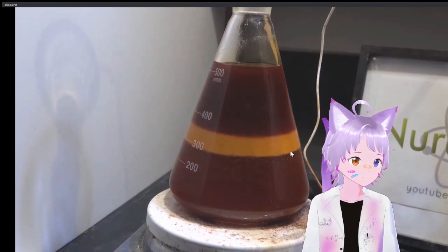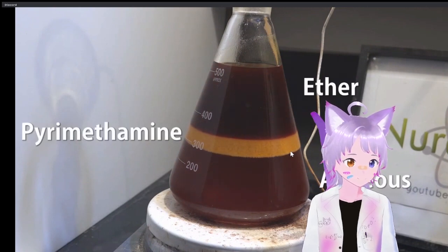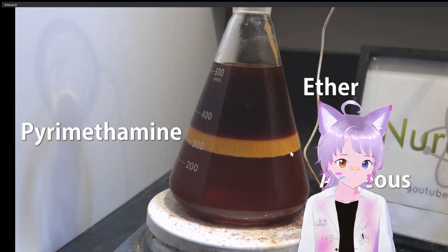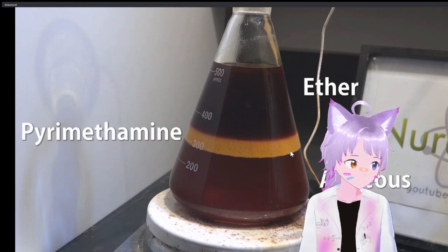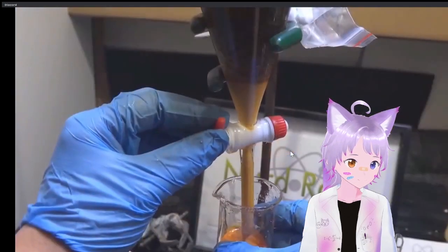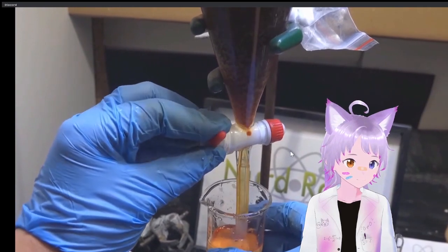And there we go, this is much better. We have a clean aqueous layer that dissolves all the salts and other polar side products and contaminants. In the upper ether layer is where all the non-polar impurities collect. In the middle is a layer of pyrimethamine. It has only minor solubility in both, so it separates into its own layer. Now we need to filter this. I first collected the middle pyrimethamine with a separatory funnel, but this is optional.